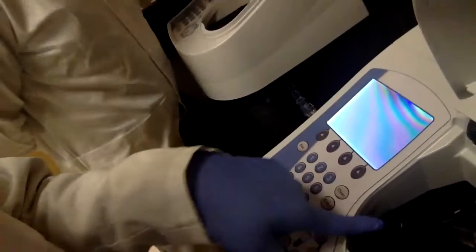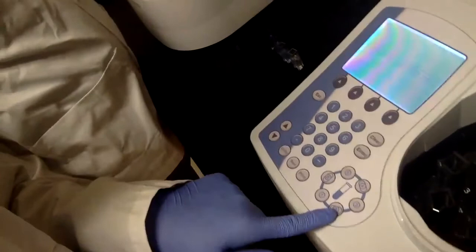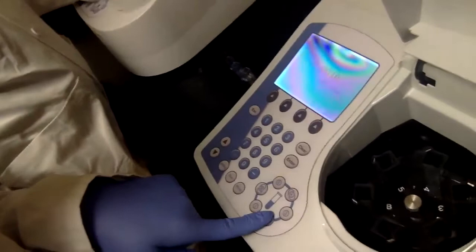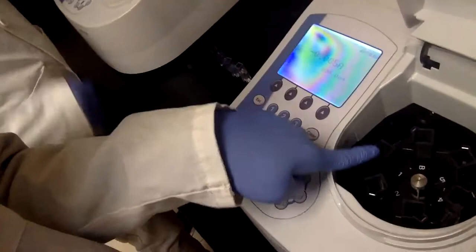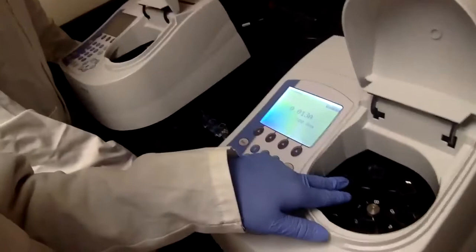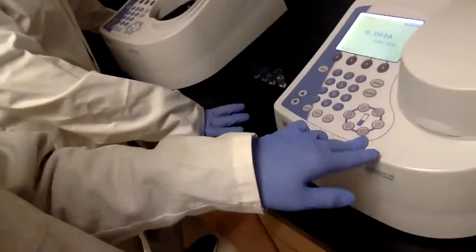So if you look at the buttons over here, if you click a button, for example, I click button number 4. For example, if I click number 1, this panel will move, and it will move number one to this measuring position. So what we are going to do next is insert all the cuvettes into the holder, close the lid, and just click these buttons. It will measure the absorbance for each of the samples.